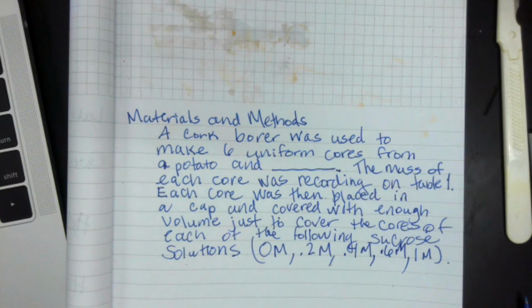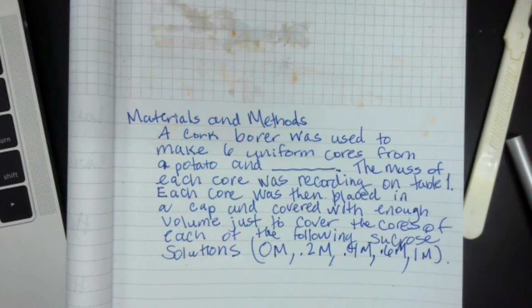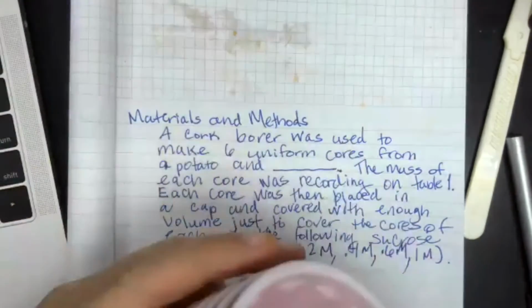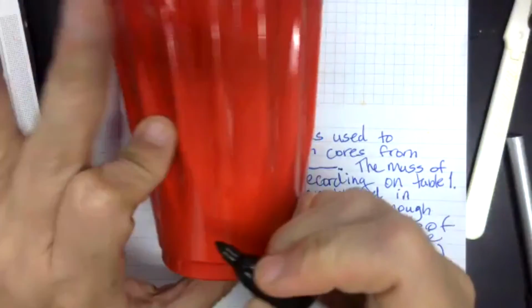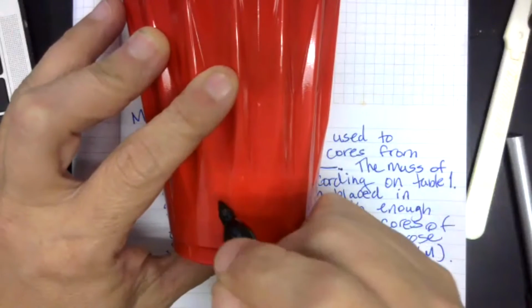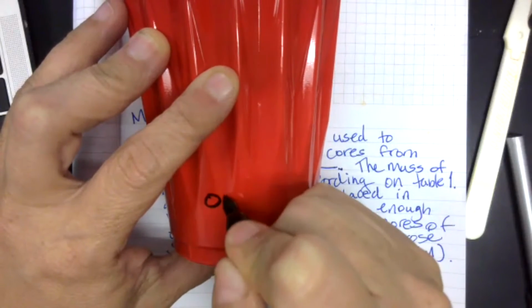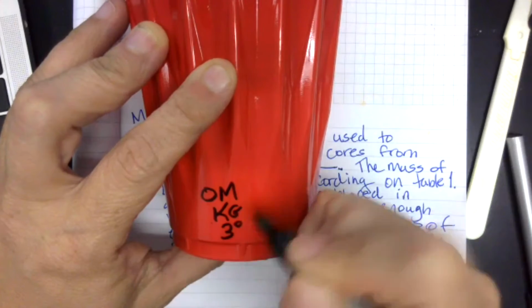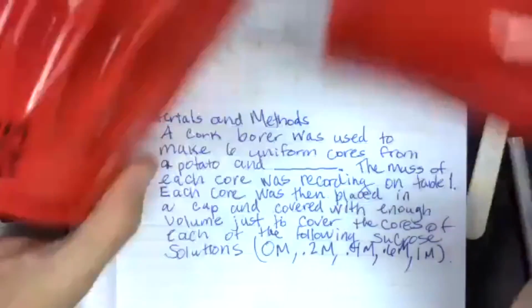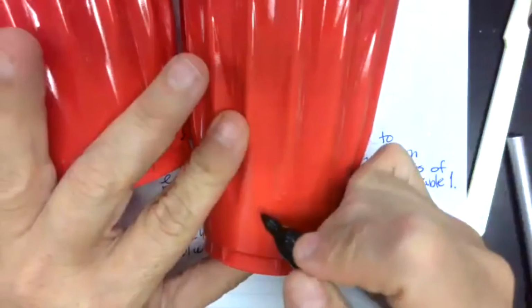I'm going to go ahead and set up my own experiment. I'm going to record the whole thing, but you have the cups. It doesn't matter what cups you use. You could use the same cups from your other experiment. I'll have cups on the cart too. Just make sure you have the molarity written on it and your initials and maybe whatever class period you are. So I'm going to label this one 0 molar, kg, and third period or something like that is fine. Then I'm going to do that for all the rest of my molars here.